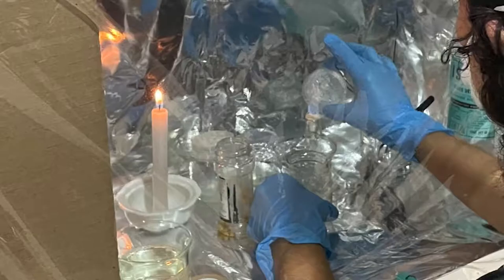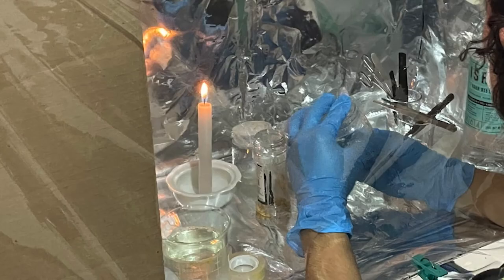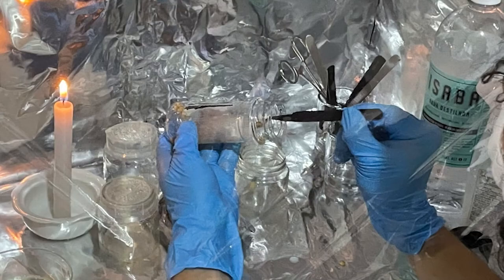The above was repeated for the next 2 containers, taking care to bring the lids and nozzles of the containers close to the fire to avoid any type of contamination.